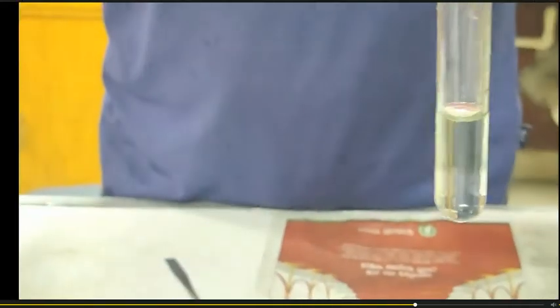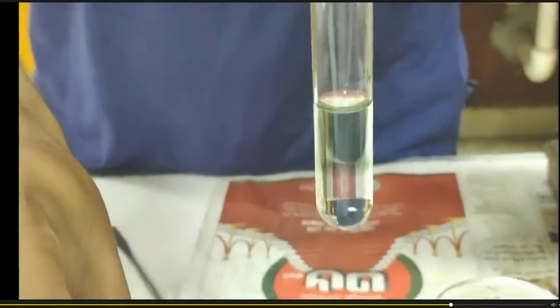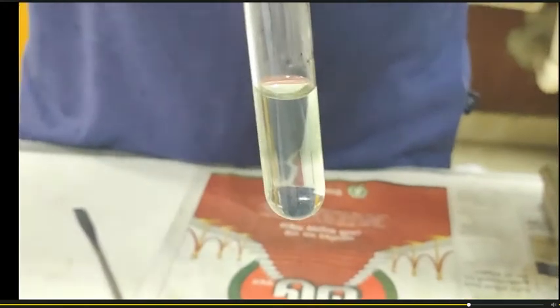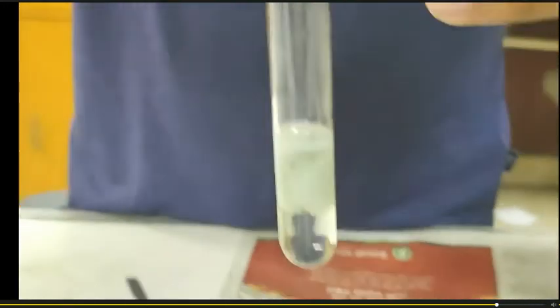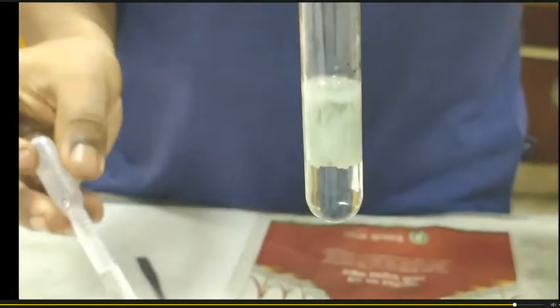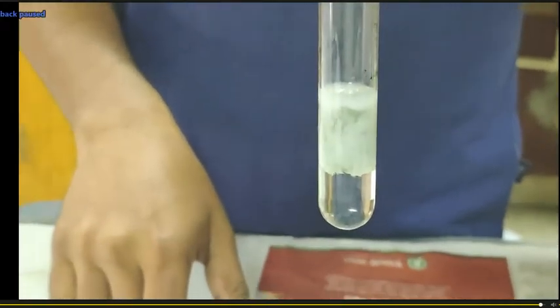Now we are going to add ammonium carbonate solution. If PPT appears, then it would be indicative of the presence of group 4 cations. Ammonium carbonate, we are going to add ammonium carbonate. There is an appearance of PPT, indicative of the presence of group 4 cations. This indicates that this sample contains group 4 cations. That's all for the test for presence of group 4 cations.